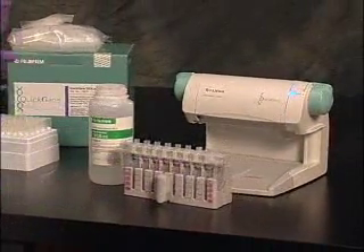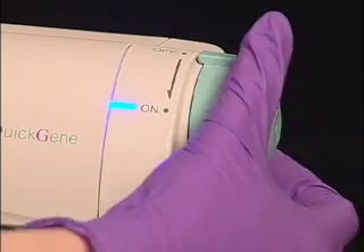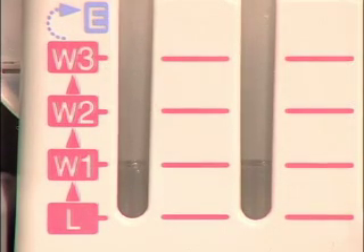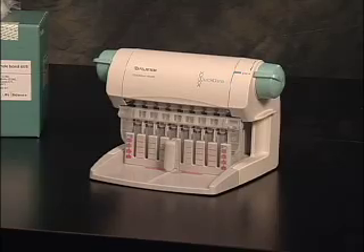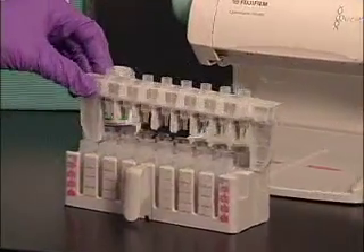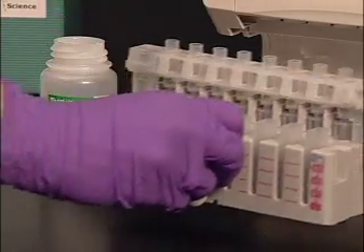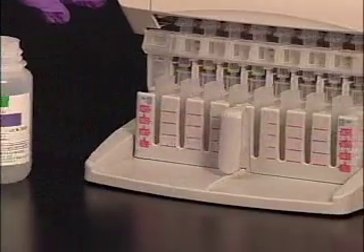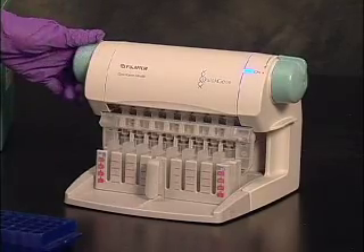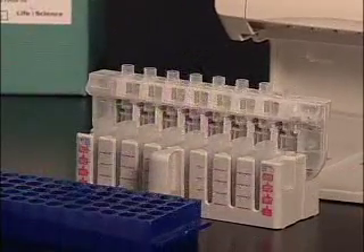Pull the cartridge and tube holder assembly forward and apply wash buffer to the cartridges. Return the assembly so that the cartridges are directly underneath the pressure heads. Turn the rotary switch to on to apply air pressure to the cartridges, making sure that the wash buffer is discharged completely before returning the rotary switch to the original position. Repeat the wash step two more times. After fully discharging the wash reagent, pull out the cartridge and tube assembly and move the cartridge holder into the elution position. Apply elution buffer to the cartridges and return the assembly to the Mini 80. Turn the rotary switch to the on position and make sure the elution buffer is discharged completely. The extraction process is now complete.